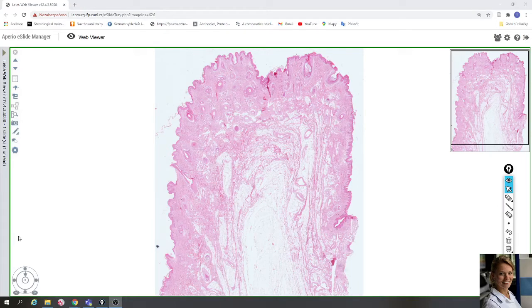In this video, we will take a look at the slide of Labia Majora. The slide is stained with hematoxylin-eosin. That means that nuclei of cells are violet and cytoplasm is pink. Labia Majora are two prominent longitudinal cutaneous folds. These are the folds.